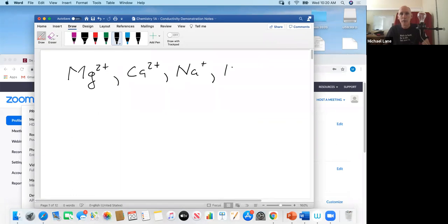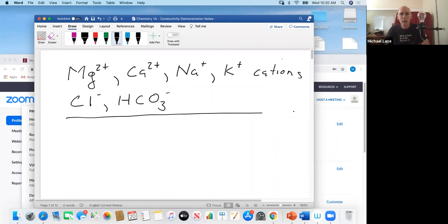It just means that these ions exist. And so these are typical cations that exist in much of tap water. There's usually some chloride, perhaps some bicarbonate or hydrogen carbonate anions, and certainly some other ones to lesser extent. The presence of these ions, even in low amounts, does give rise to some conductivity. So those are the things that make the tap water conduct electricity.